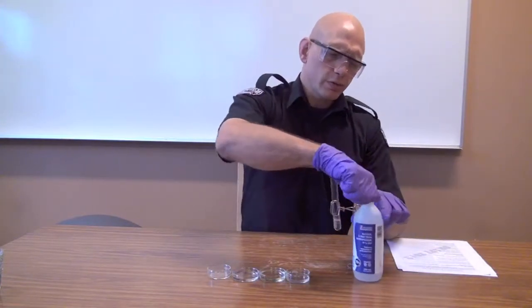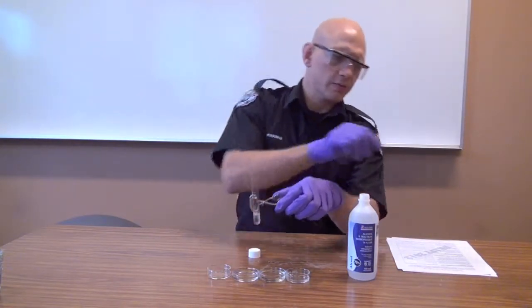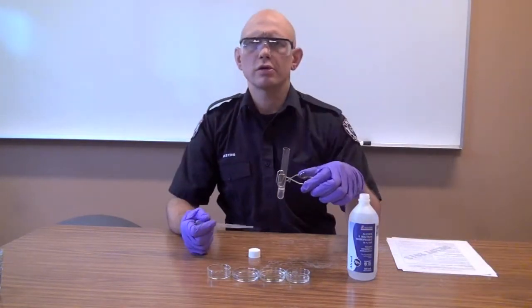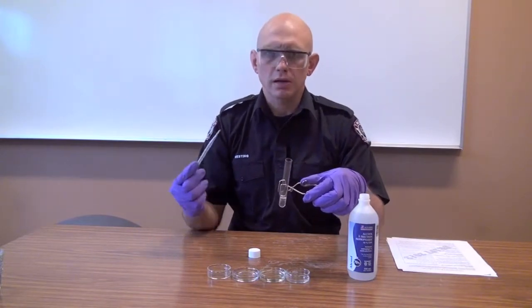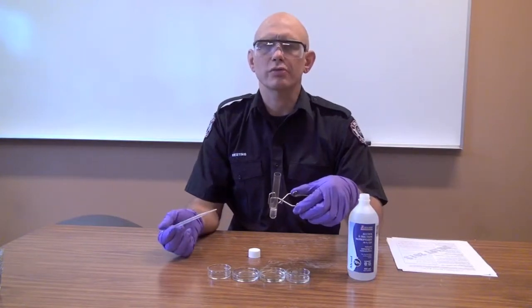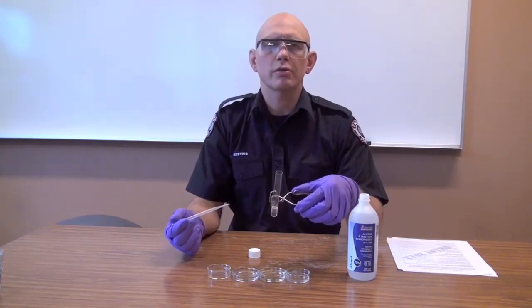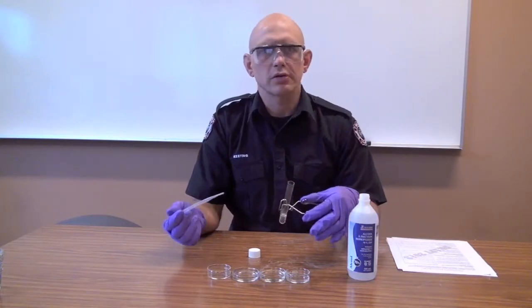I'm going to show you how to do it. You put about an inch of water in a test tube. You're wearing your proper PPE — at a minimum, you're going to be wearing glasses and gloves. I know what this chemical is; it's rubbing alcohol, so I don't need to wear a respirator. You may well need to wear a respirator, SCBA, some kind of suit — that's determined by the call.